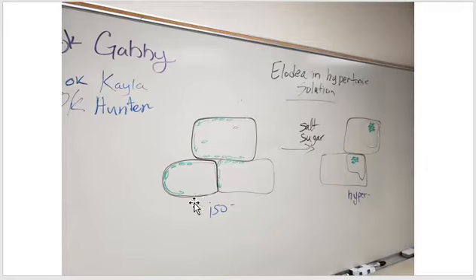The idea is that in a regular elodea cell, the cell membrane is hugged up on the inside of the cell wall, and you can actually see the chloroplast moving and grooving as the plant is living. Add salt or sugar, and that cell membrane pulls away from the wall, causing clumping of the chloroplasts. And so that's the effect that we're seeing with the hypertonic solution.